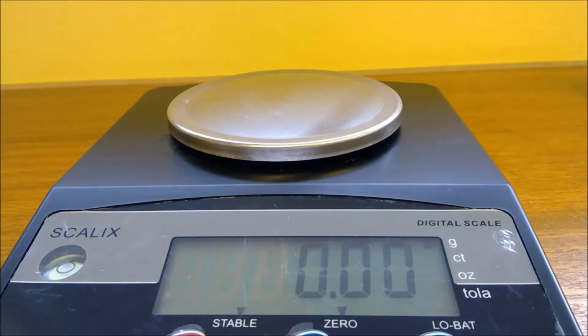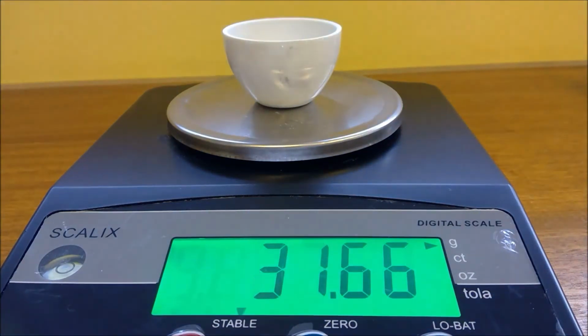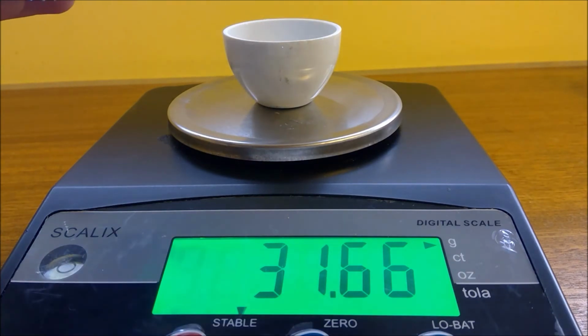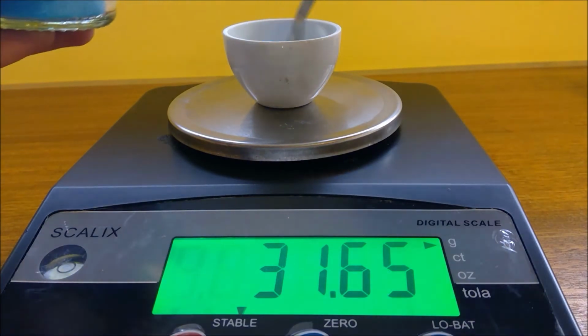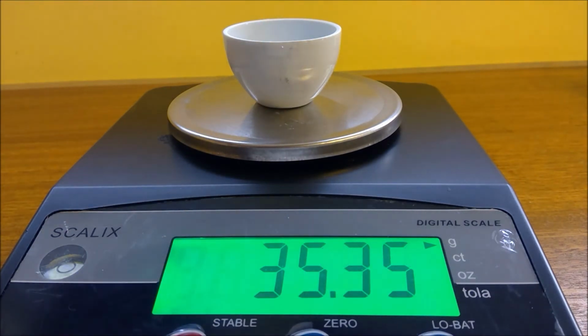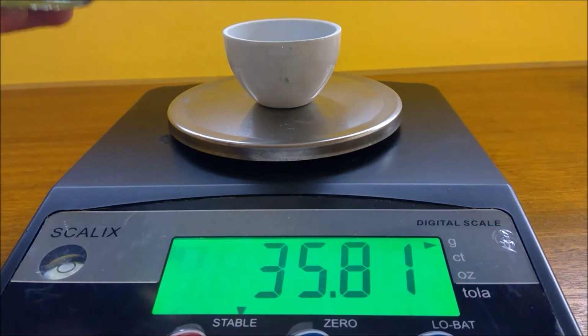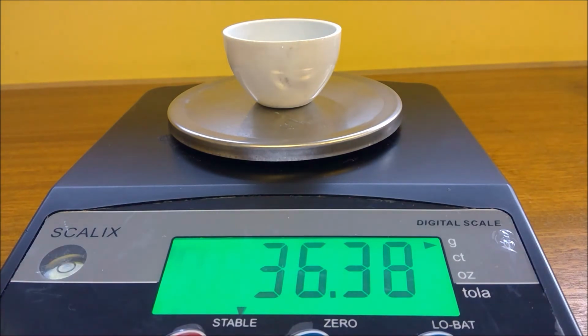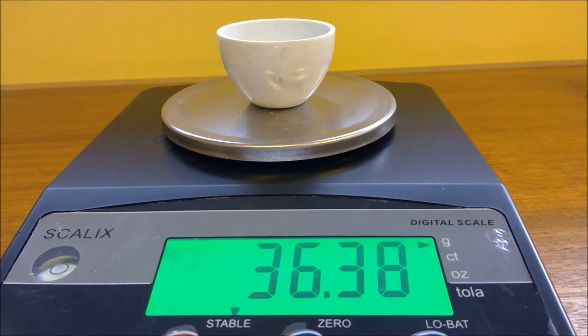So the first thing we're going to do is record the mass of our empty crucible. Okay, so pop that down on your results table. And then we are going to add to that about 5 grams of copper sulfate. So I'm going to go to about 36.6 grams. It doesn't matter exactly what mass I end up with, just that I know how much it is. Let's do a little bit more. Okay, so record that mass in the right box on your results table as well.